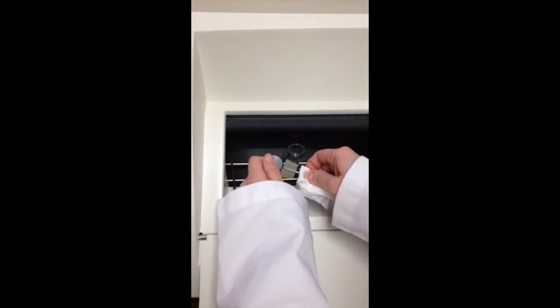Gently rock the cell back and forth. Just like before, you will clean the cell with a clean wipe. Clean the temperature probe first before you insert it into the cell.